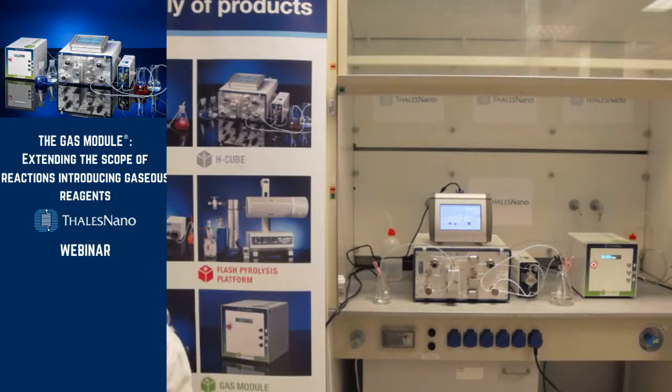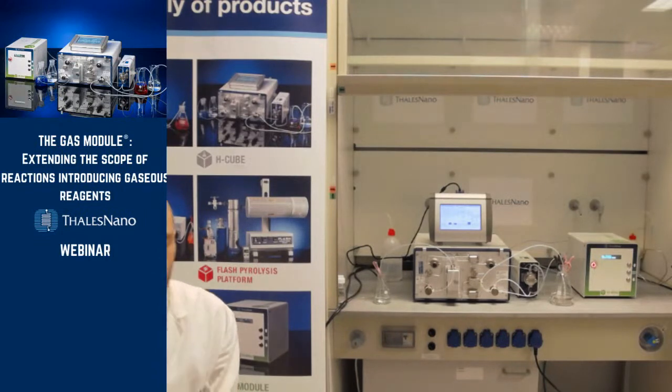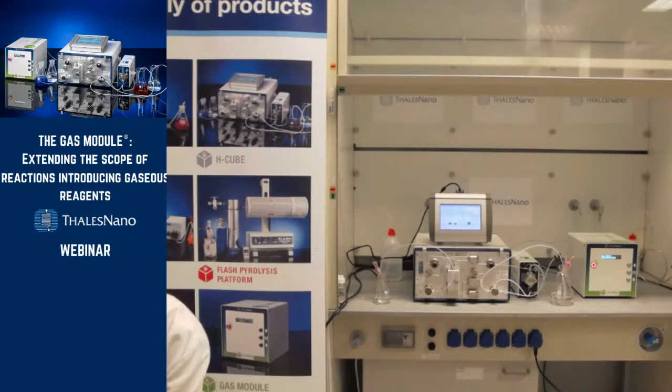Another question is coming. How many gas cylinders can be fitted to the module at once? Right now, the gas module allows only one cylinder at a time. You can use this gas module with, as I said, 14 different gases, but one at a time at the moment. But we are also working in parallel on a gas module that could handle 2 cylinders, but it's not yet developed.